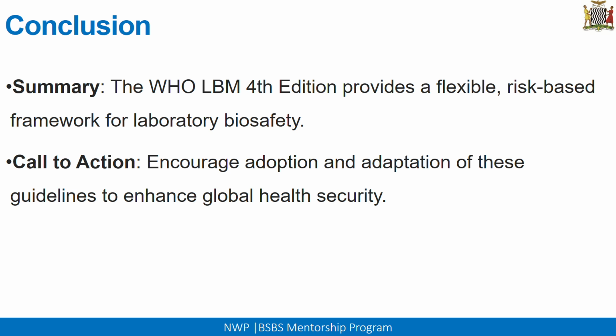So in conclusion, the WHO Laboratory Biosafety Manual, 4th edition, provides a flexible, risk-based framework for laboratory biosafety. So emphasis, laboratory biosafety. Remember, this is a laboratory biosafety manual.